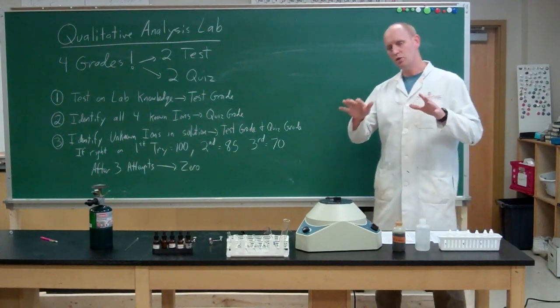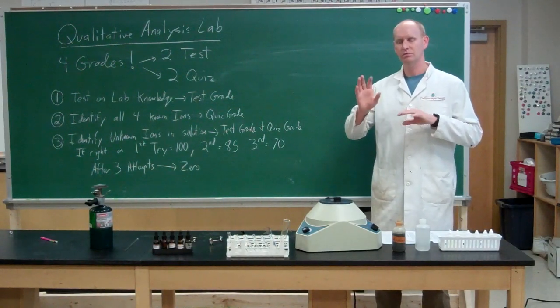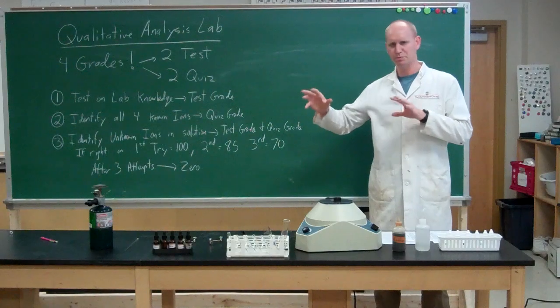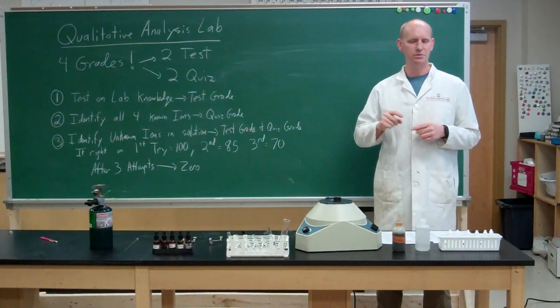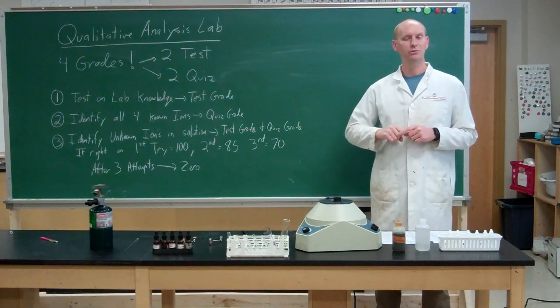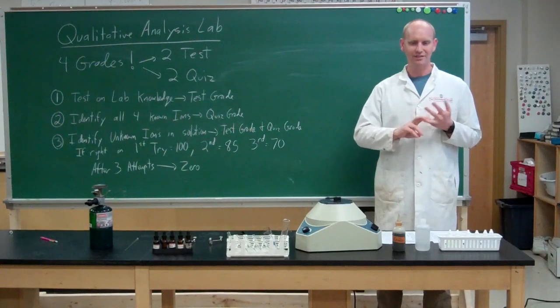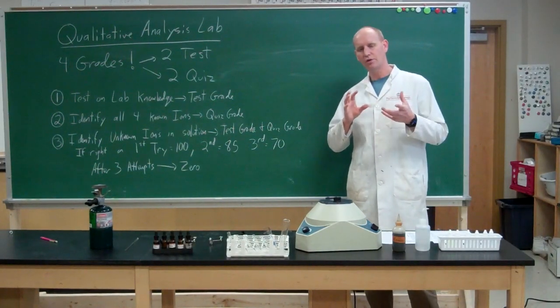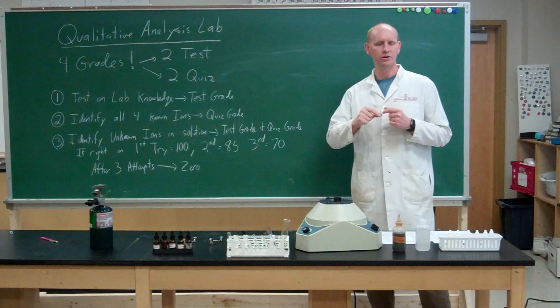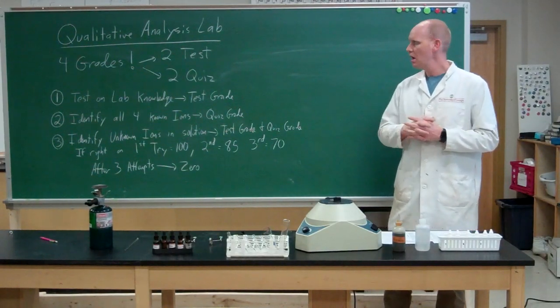And as a general rule, solubility is based upon 3 big groups pretty much. There's solids that are precipitated out as chlorides or other halides. There's solids that are precipitated out as sulfides, and there's solids that are precipitated out as hydroxides. And then you still have some other kind of odd ones in there. Your silver, your mercury, your lead sometimes precipitate out a little differently.